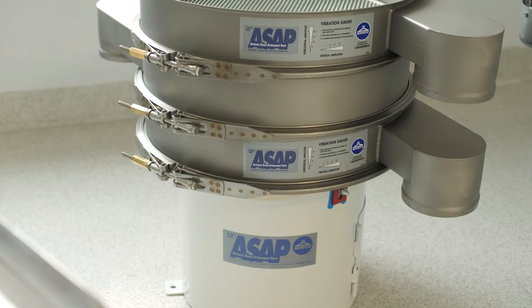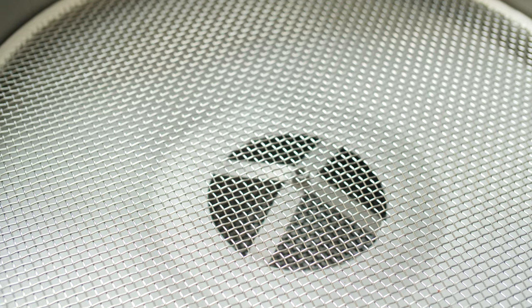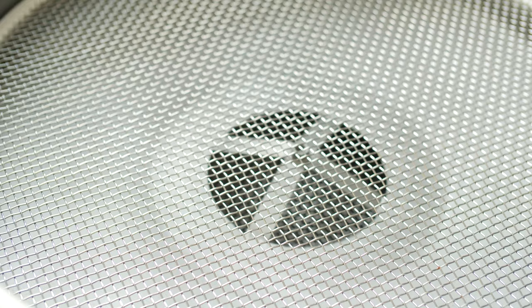After we've milled the powder, we may need to sift it, and we have the capability to sift and get various particle sizes through the action of sifting.